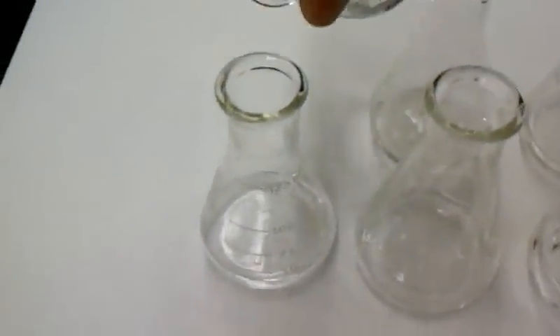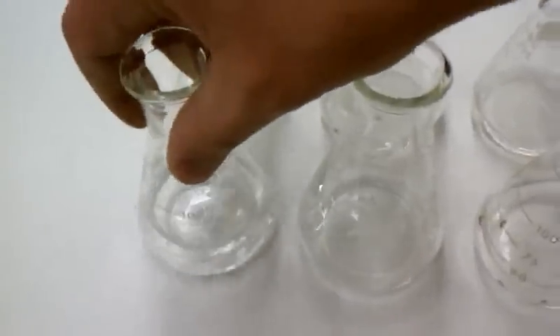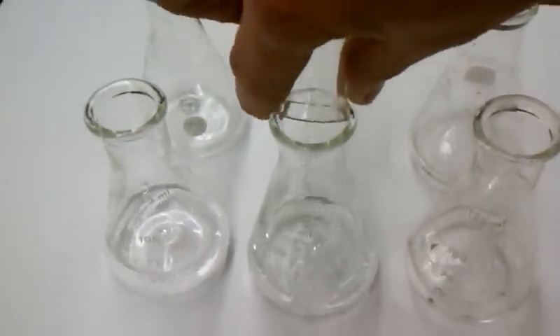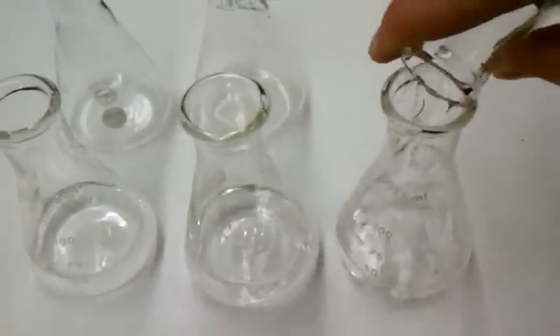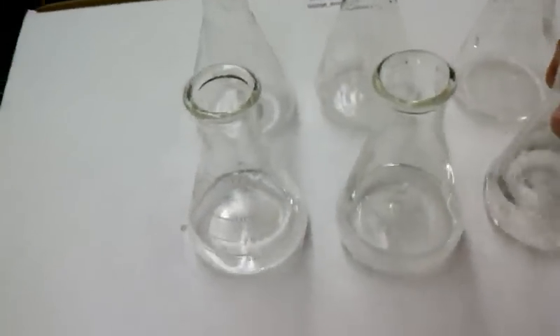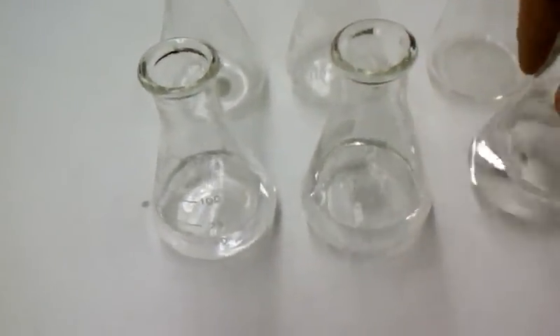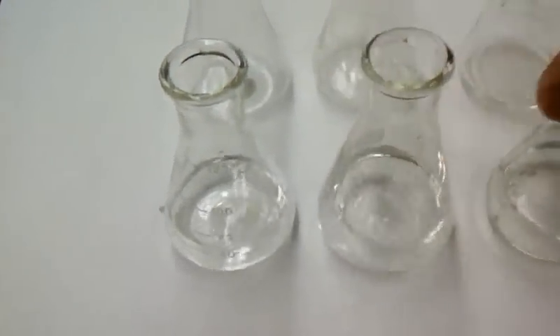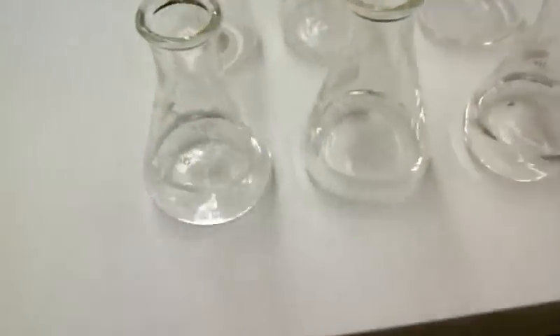So you go ahead and quickly pour it in, mix it out. Pour it in, mix it out. Quick pour it in, mix it out. And you need to kind of keep swirling these as it goes by. Keep it well mixed, and that way the reaction can occur about the same.